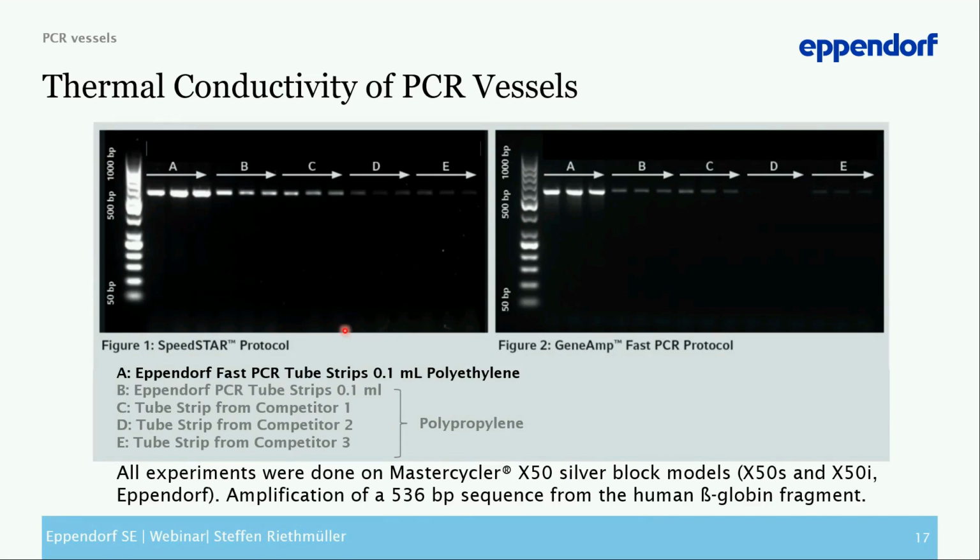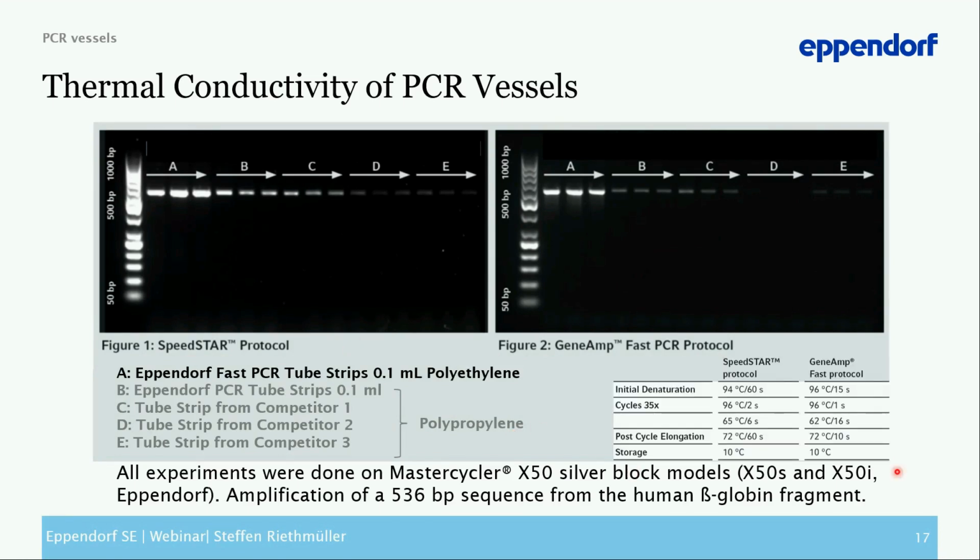And here you see both protocols which have been used, and you see that the step time is very short. Like for instance, here the denaturation just takes 2 seconds and here just 1 second. So the protocols are very, very short.